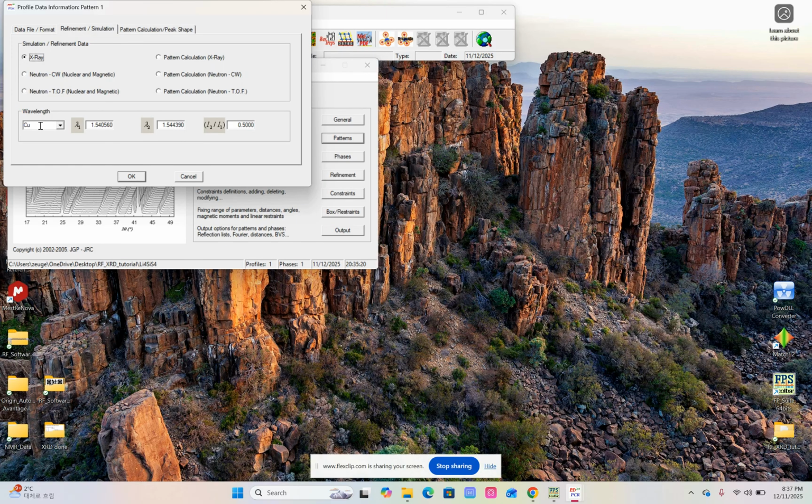The difference in the X-ray source really makes a huge difference in the refinement. You will never achieve a good refinement, maybe even after a certain time the software will collapse, if you choose the wrong X-ray source, because with the X-ray source you also change the energy level. As you can see here, it's completely wrong. It's circa half in case of molybdenum and copper. So we remain with copper.